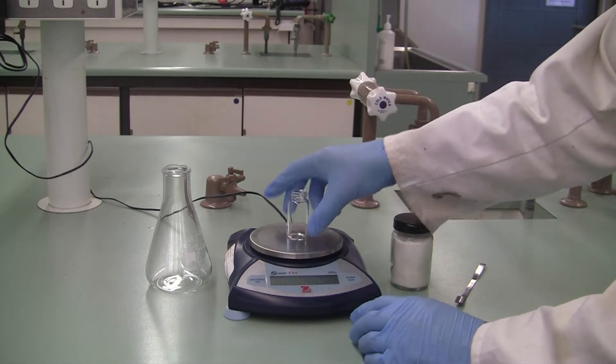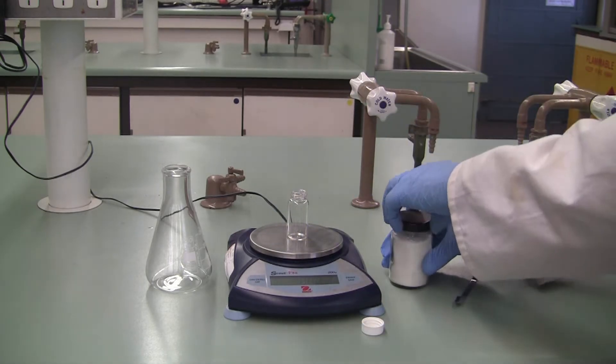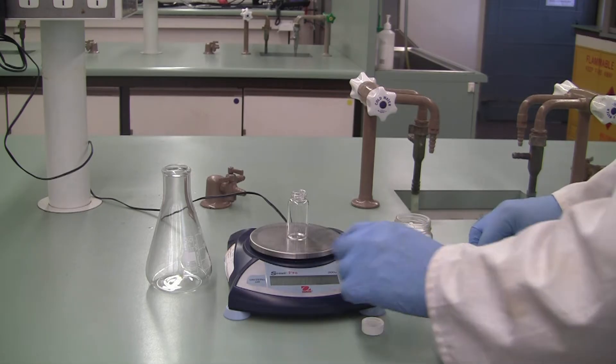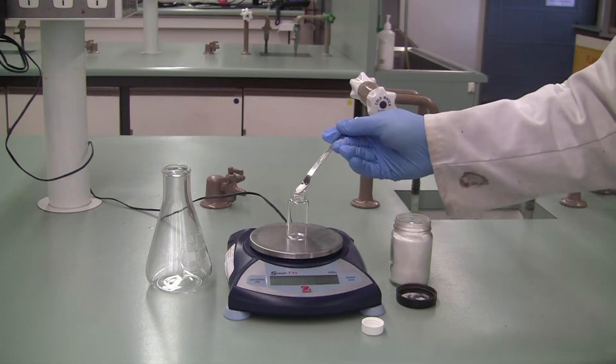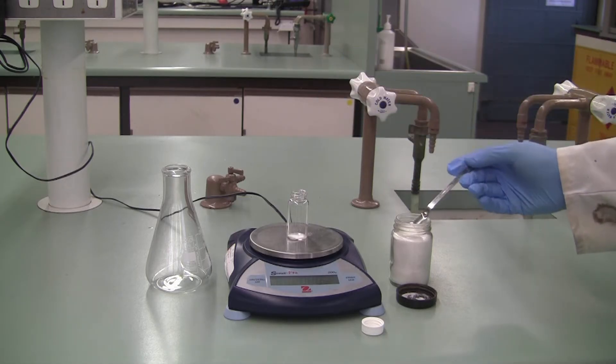Take the lid off and place it on the top loading balance. Get your solid ready, zero the balance with your vial on, and weigh in the approximate mass you need. Here I need about 0.2 to 0.3 grams.